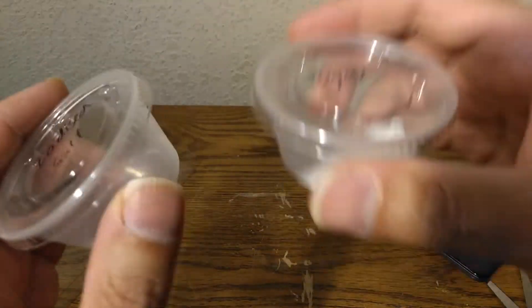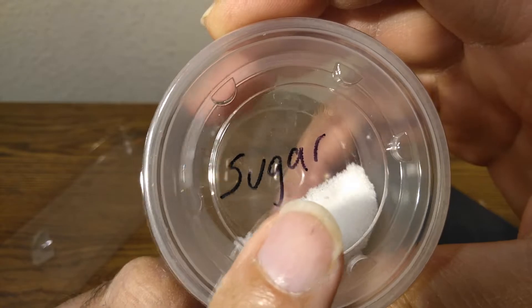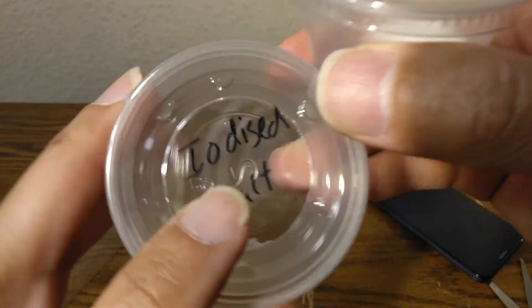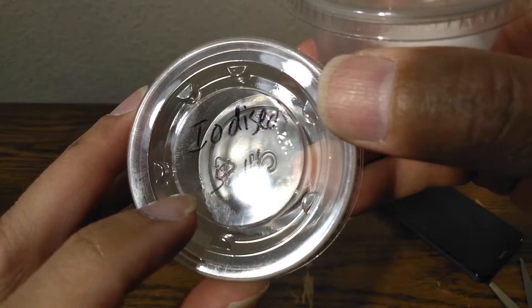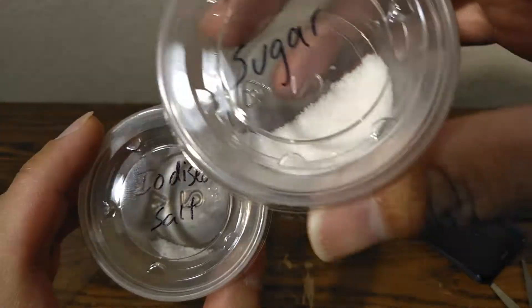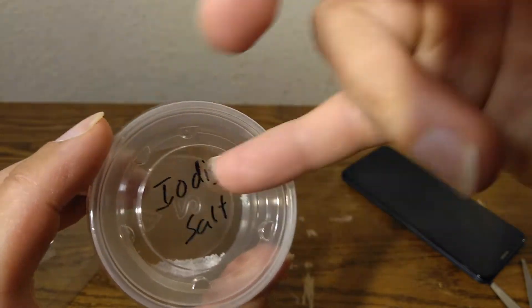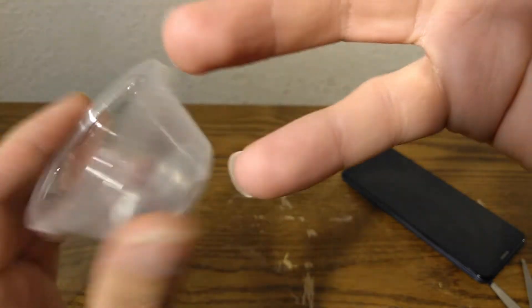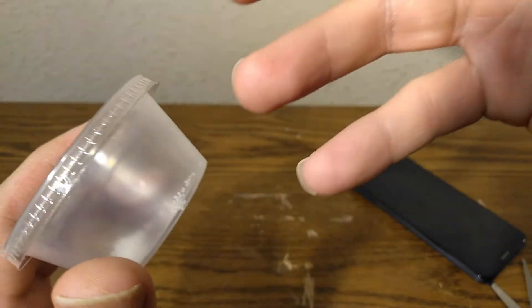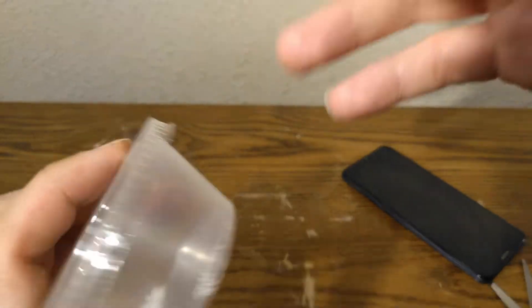The next thing we're going to look at is regular table sugar and this is iodized salt. Sugar should be somewhat transparent, but this salt — because it has iodine — we're going to see if we can spot it. I'm not a chemist, but maybe we can spot it, maybe not. Let's find out.